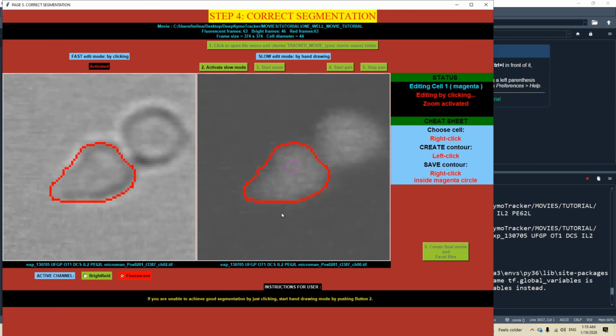In other words, the segmentation error happened due to the tracking error. And what we are doing now when we keep left clicking on the cell is trying to correct this tracking error. The segmentation neural network takes the coordinates of your clicks as the centroid's coordinates and tries to segment that cell using these coordinates. So our clicking is essentially a trial and error method.